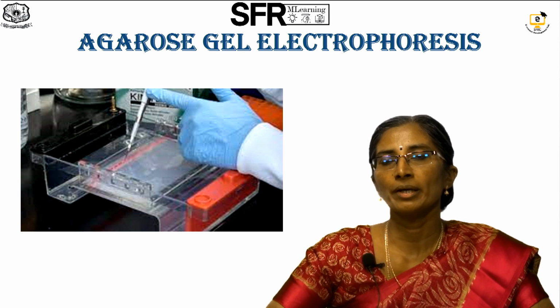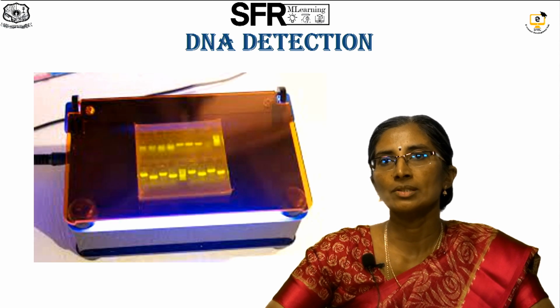And we have to supply power, that is electrophoresis, that is the mobility under an electric field. So it will move DNA, as it is negatively charged, from cathode to anode, that is from negative to positive. And after doing this gel electrophoresis, we can observe this by using the UV transilluminator technique.